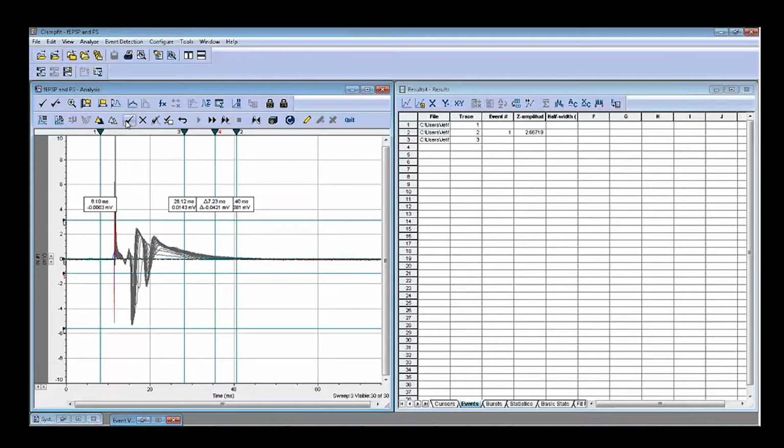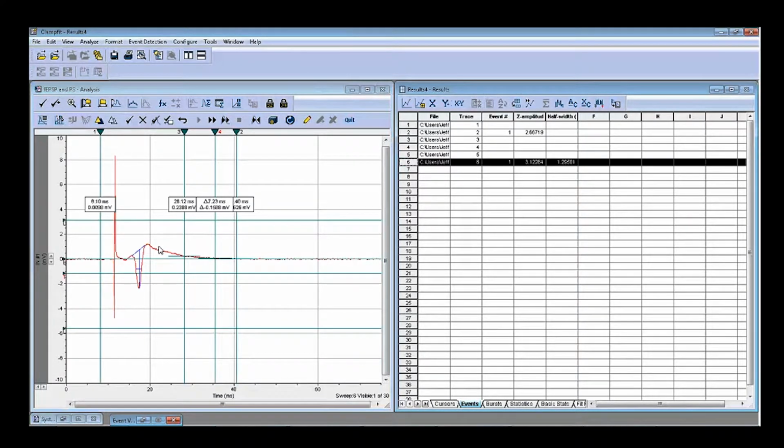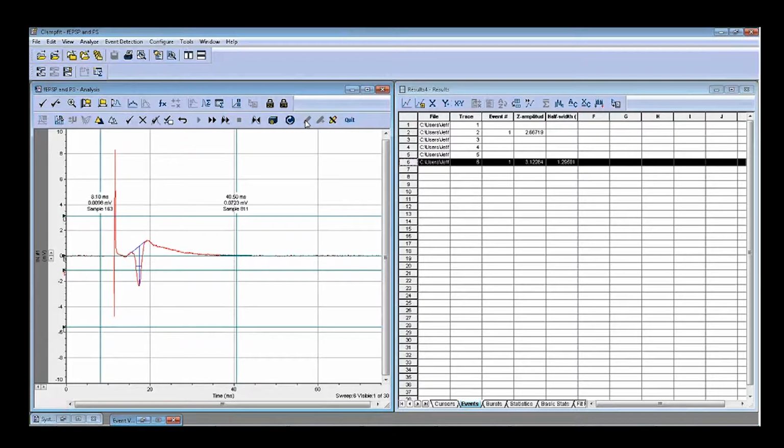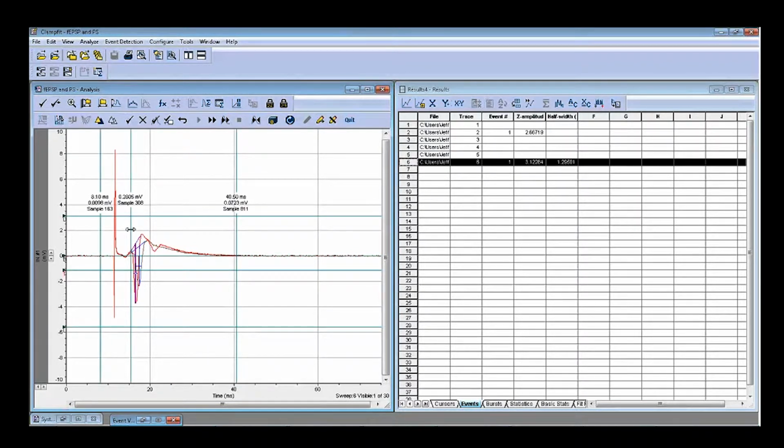Okay, here. Now, what happens is that if you want to modify this one, click this one, and 6. Now, in here, you have something called enable editing. You click this one. Now, you can put the cursor near here so that you can add the search parameter, okay?